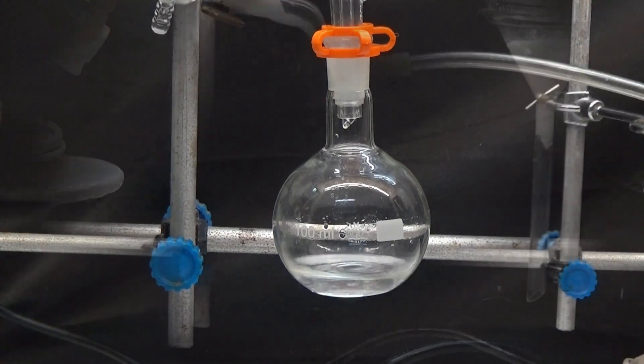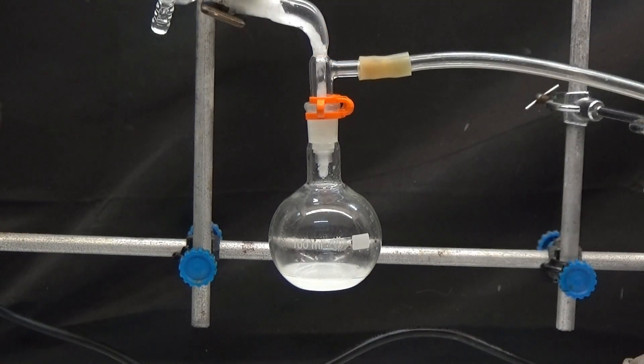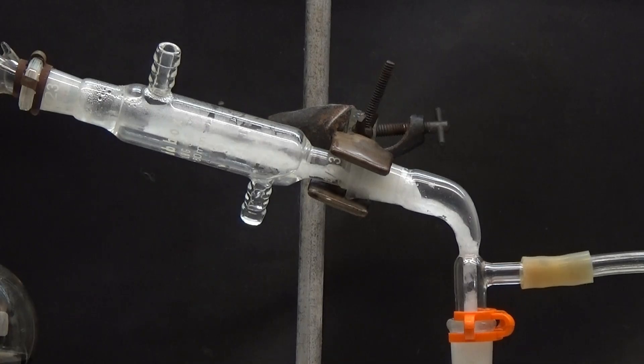During distillation, a white solid crystallizes in the condenser, which could potentially clog it. We have stopped the distillation and verified that the solid that crystallizes in the condenser can either be monoethyl phthalate or unreacted phthalic anhydride.